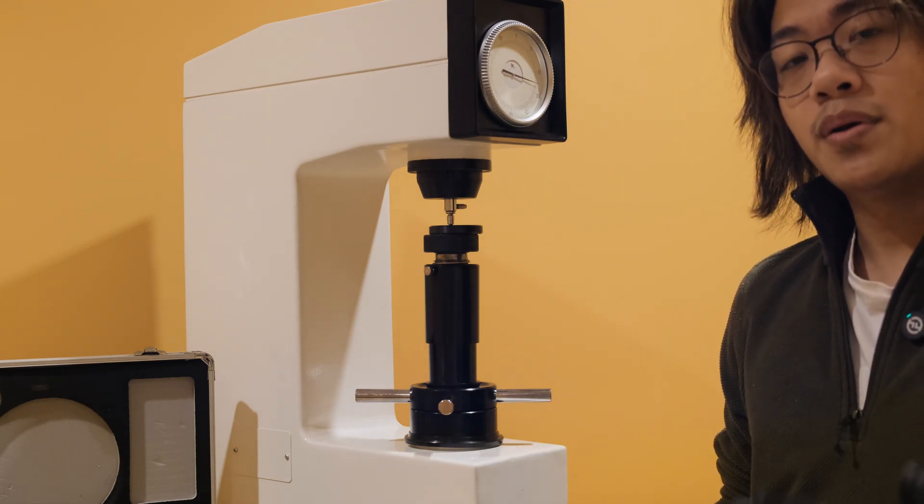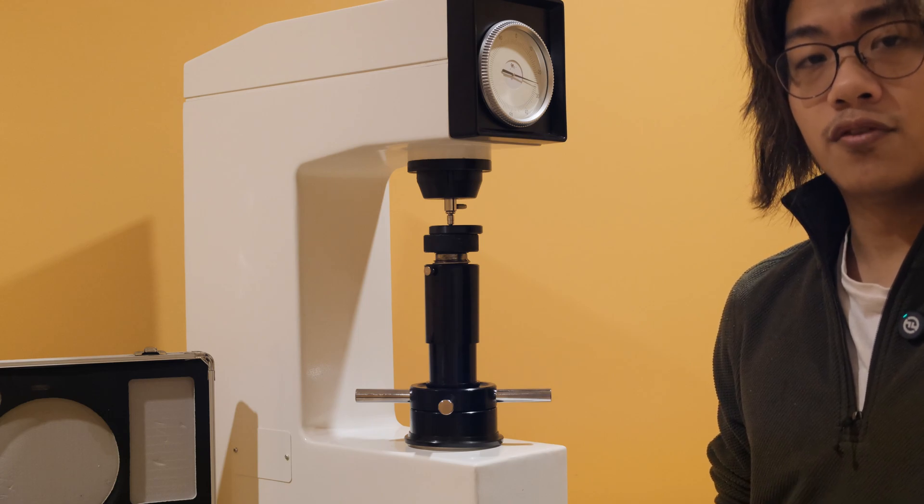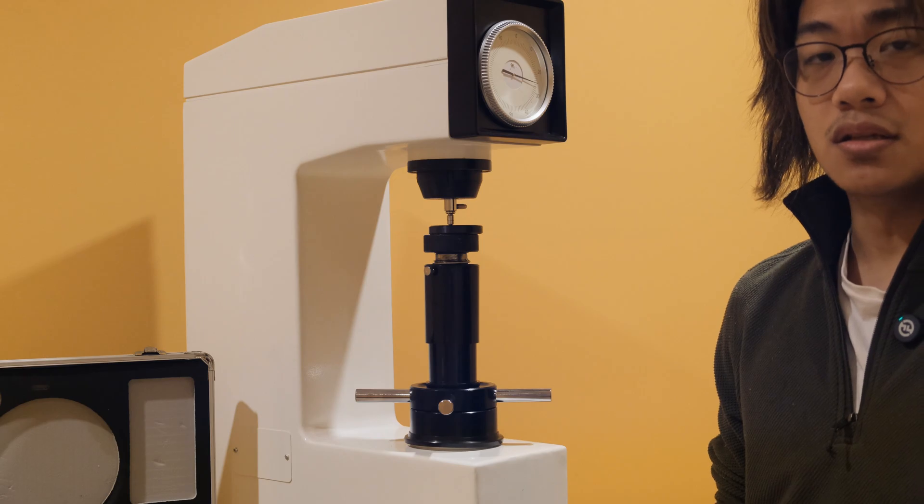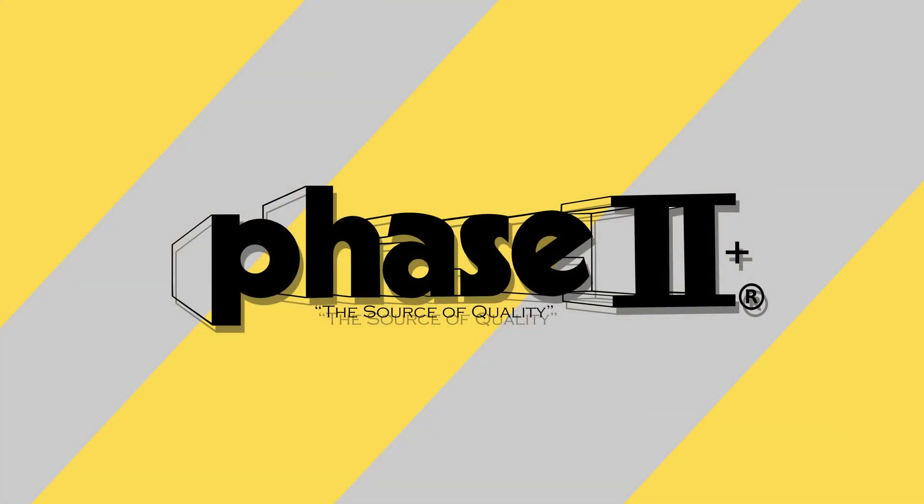Note that it is best practice to discard the first result and take tests in batches to ensure consistency in the sample. This concludes our applications and functions of the Phase 2 900-345 Superficial Rockwell Hardness Tester.